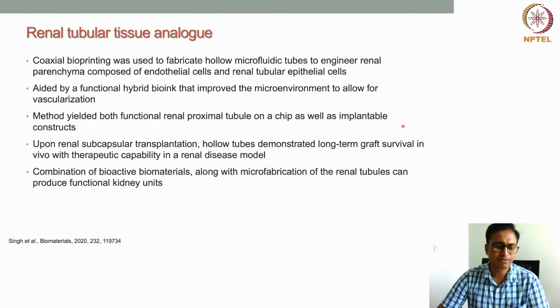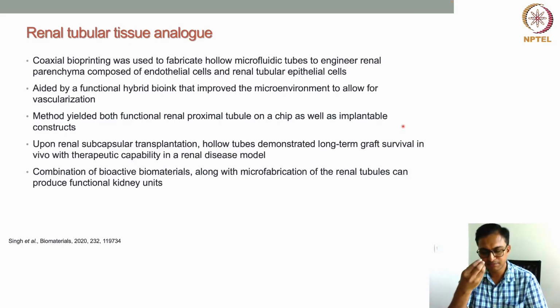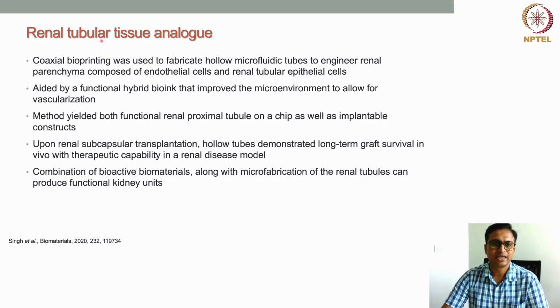Then there are many more studies that have actually been targeted to find out certain aspects of this or to recreate some part of these kidney structures. Like another study by Singh et al. They published in Biomaterials, where they have shown 3D bioprinted renal tubular tissue analogs.